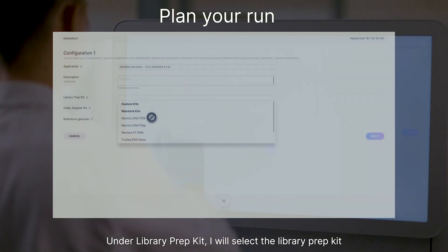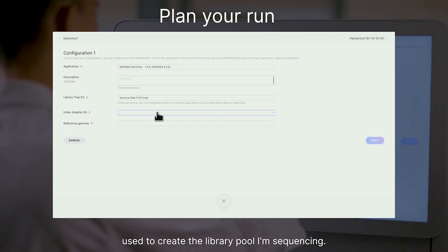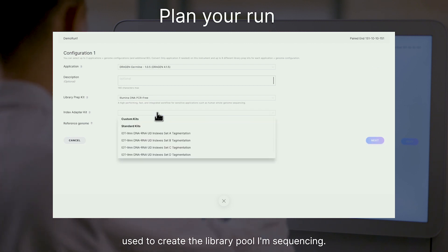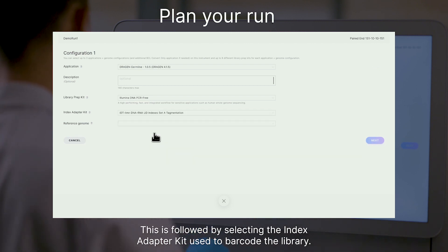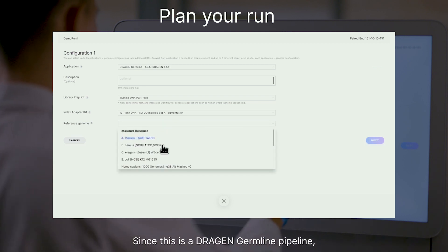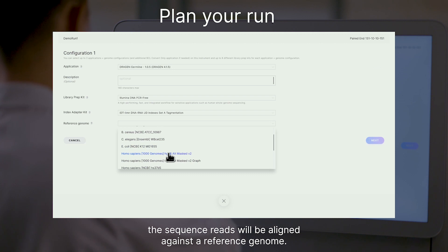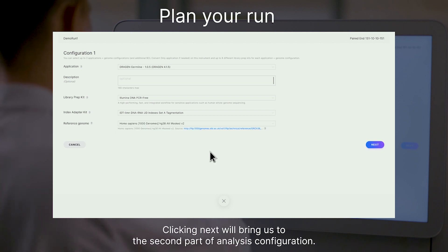Under Library Prep Kit, I will select the Library Prep Kit used to create the library pool I'm sequencing. This is followed by selecting the Index Adapter Kit used to barcode the library. Since this is a Dragon Germline pipeline, the sequence reads will be aligned against a reference genome.